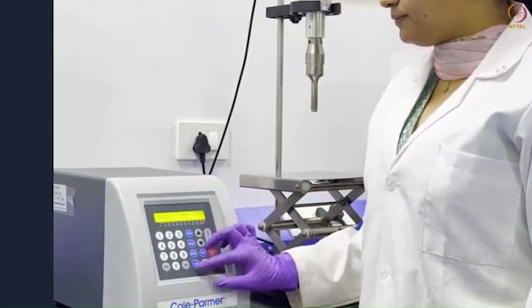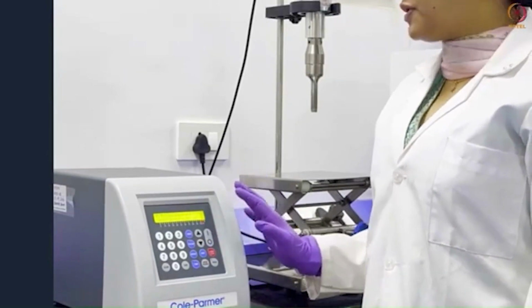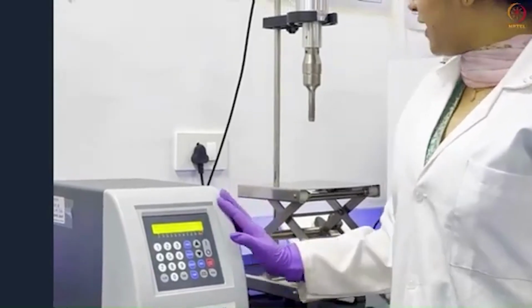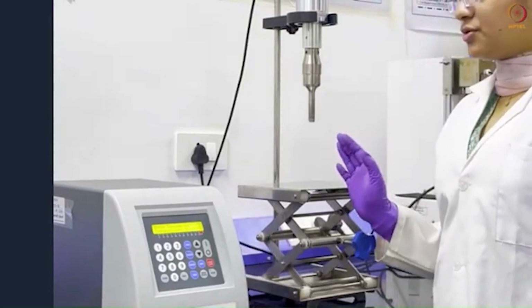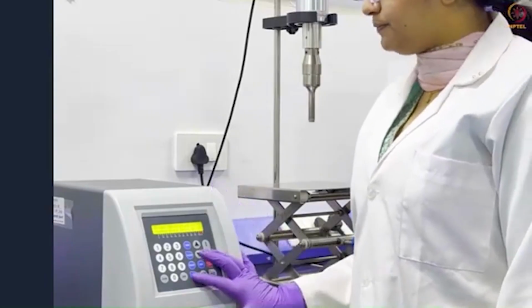Then here is the temperature. We can set the probe temperature and the temperature of the setup in the ultrasonication process, but as you can see here, there is no digital thermometer attached to this equipment. So initially we do the experiment at room temperature.